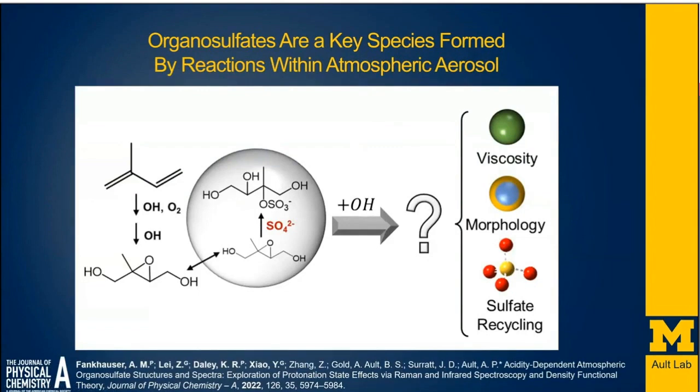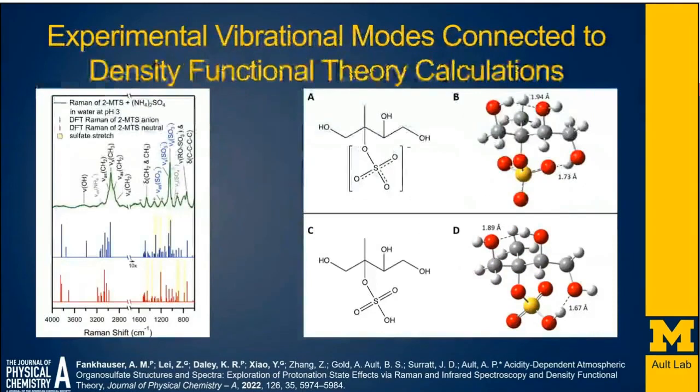So how does this tie into OPTIR? Well, one of the things that my collaborator is able to do is that he synthesizes pure versions of these methyl tetrol sulfates that I just mentioned on the last slide. And so those organosulfates have just been recently synthesized in the last 5 years. And so we wanted to, really at a fundamental level, understand what they were made of.